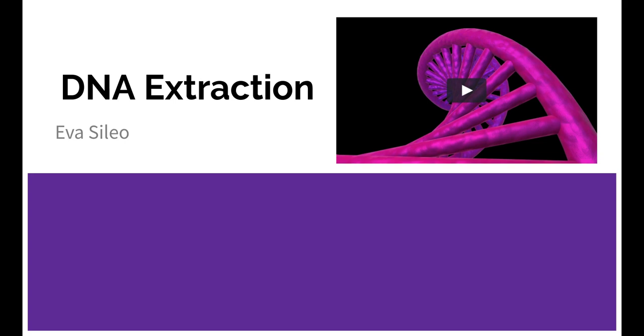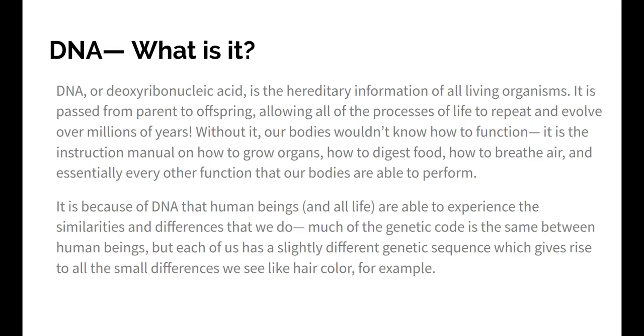So DNA extraction is something that I do at my job in the hospital quite a lot, which is why I chose this topic. I also could see myself teaching it in the future because it encapsulates a lot of very relevant things about biochemistry that I would aim to teach in my science classroom, while also being a fairly cheap and easy and fun tactile activity that produces pretty tangible results. So this is probably a refresher course for you guys, but I tried to design this as though I were teaching it to children.